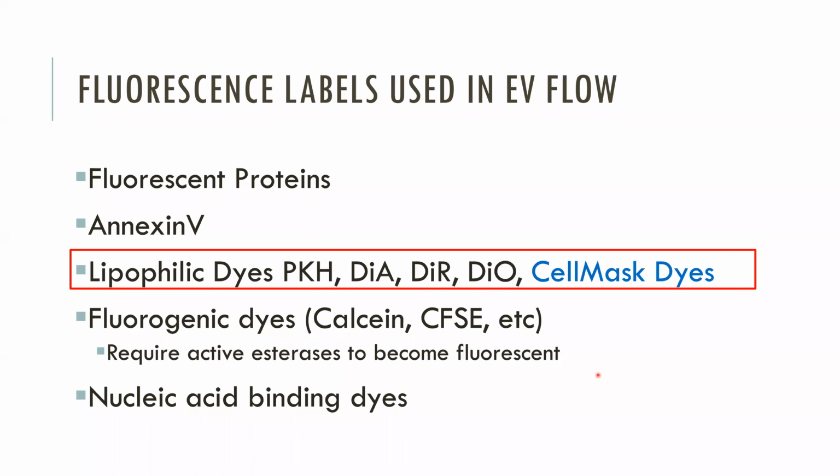People have also tried nucleic acid binding dyes, including DAPI and Hoechst, and this is going to be dependent on the membrane permeance of the dye, as well as clearly the nucleic acid content of the particle, which is not 100% of them will be nucleic acid binding. You also will, if you saturate the nucleic acid, you still need a signal that's bright enough to be able to pull them back out of noise. So the lipophilic dyes were what we ended up going with.